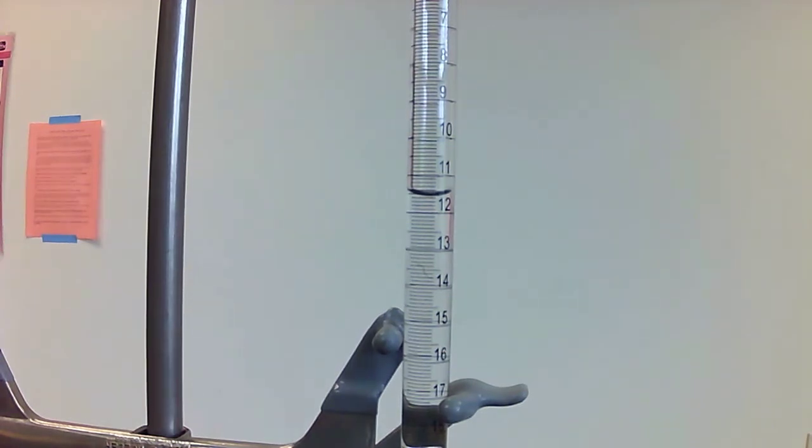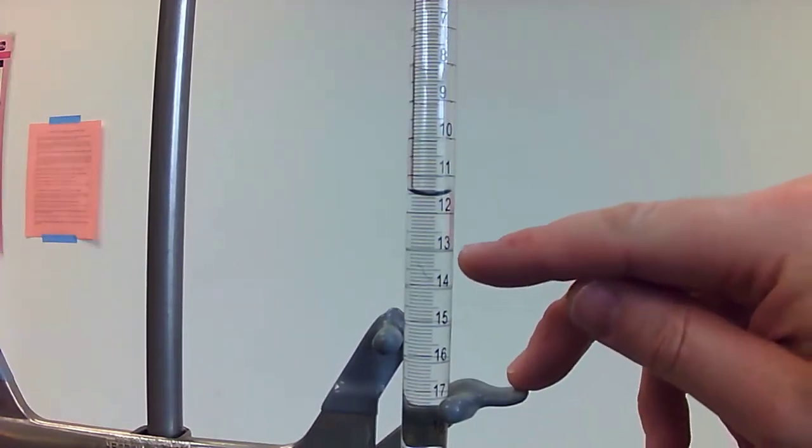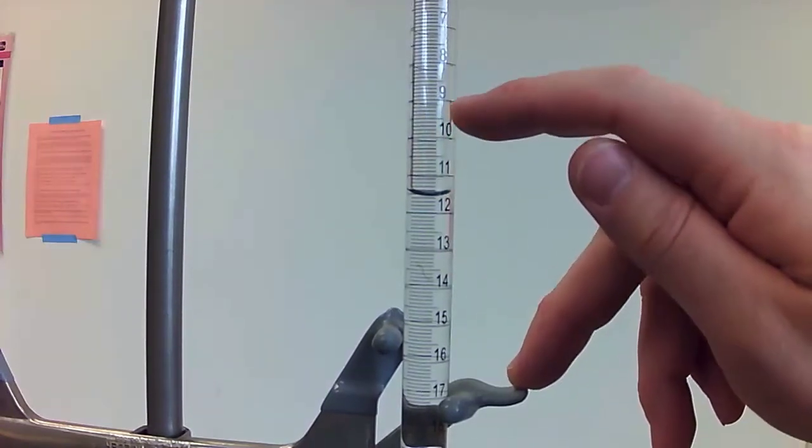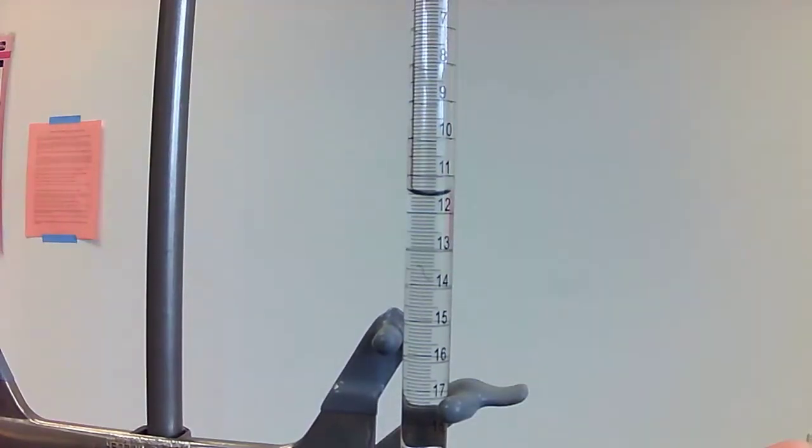When you're measuring, the first thing you have to do is move your eyes so that they're on the level of the liquid in the burette. You can tell you're there when the line, the bigger line, looks straight. If you look at the ones farther down, you can see the front edge and the back edge of this line.